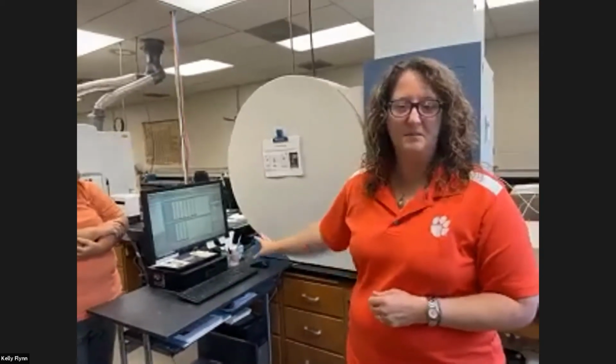The data that's collected from these computers from this instrument is uploaded to our databases, and what Michael collects over on the pH machine is also uploaded to our database, and the combination of those results is what we use to generate our soil reports. Hopefully you've received one in the mail or email. So that's how we combine all of that data and databases, and then look at the algorithms and the recommendations you're going to get for what you actually need to do in the field. So that's a very quick rundown of what we do with your soil samples.